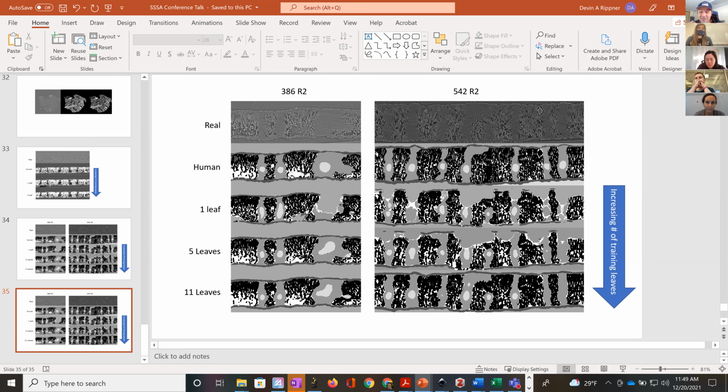If you have an annotation library already, there's a lot you can do with it, because you can just feed those images in. That's one challenge with Guillaume and Mason's code: for every leaf you have to annotate 6 images. That's right. This could be really useful, Lila, for your work with Arabidopsis and the brassica, because those will all be pretty similar. Yeah, for sure. That would definitely be better than doing each leaf.